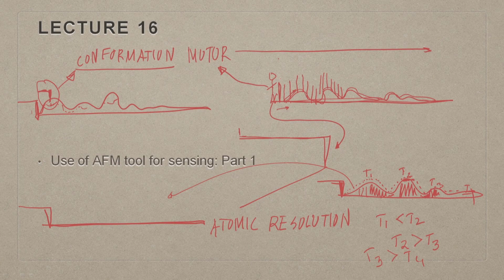Now, think of it. Here you have a surface, here you are tapping it with AFM, and on top of that, say for example, you have another microscopic view somewhere or other, if you could put it together, and underneath you have some kind of a spectroscopic setup.